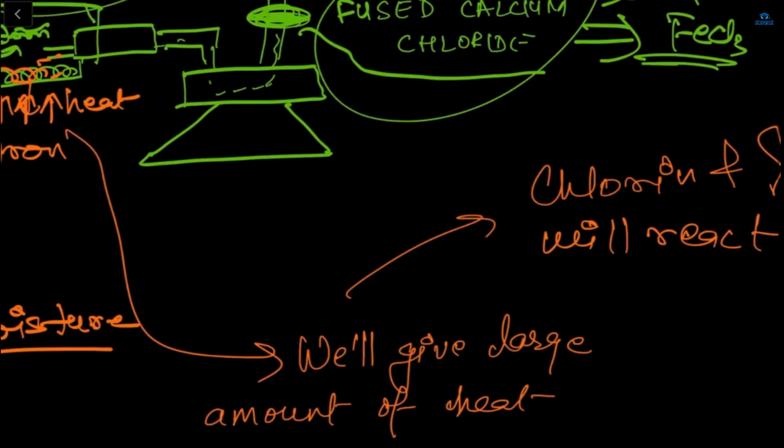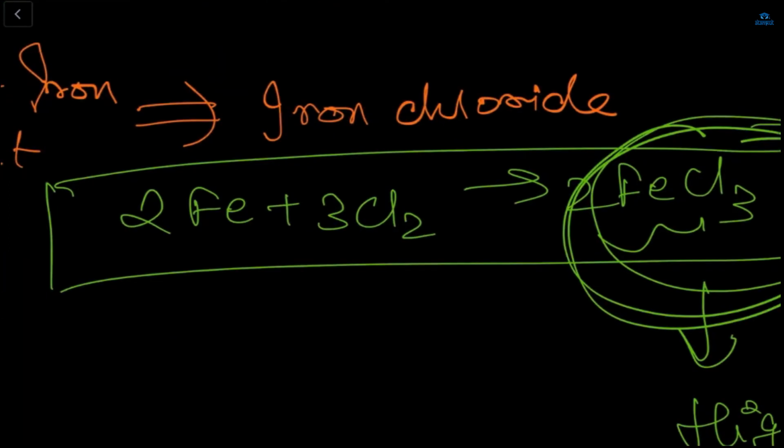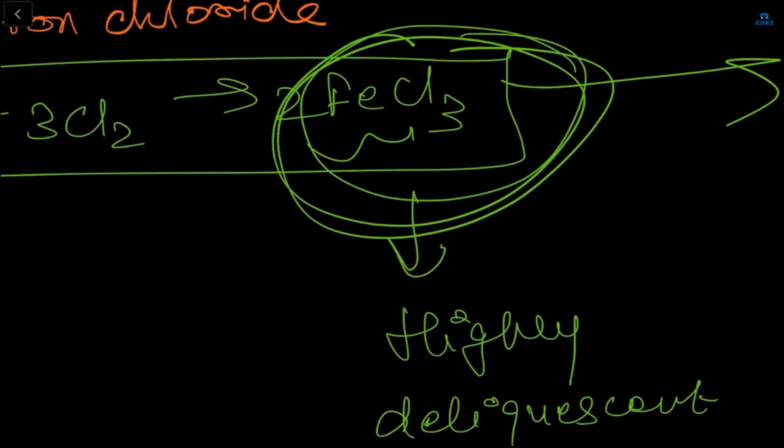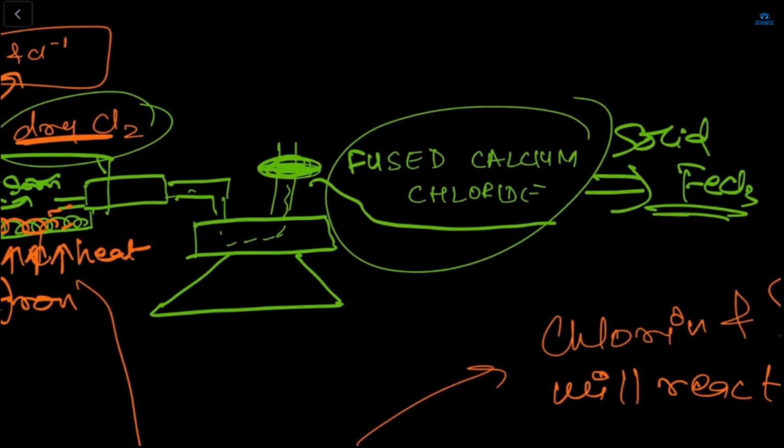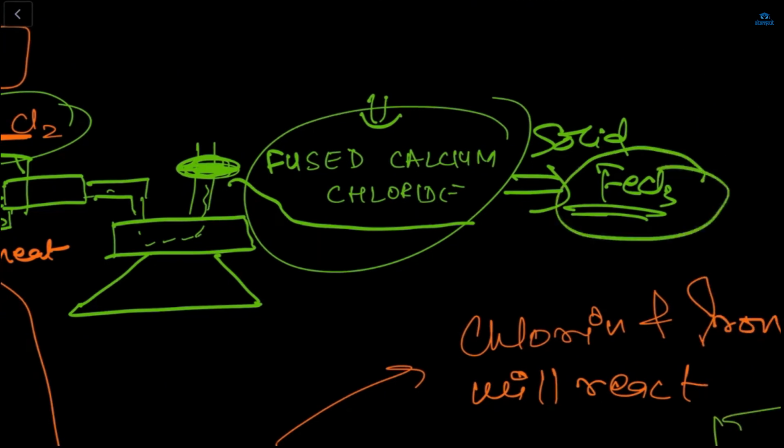But after the reaction, some small amount of moisture is still present. Then what we will do? Again, we will pass it through this one, and here your fused calcium chloride is present. The use of this fused calcium chloride is that it will remove all the small amount or whatever large amount of moisture is present. And then we will get a solid iron chloride.